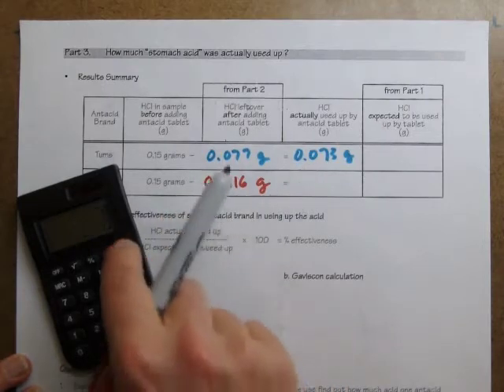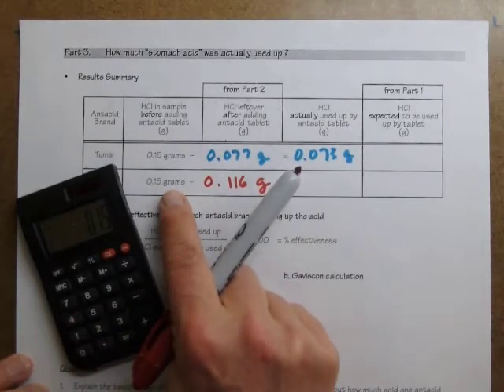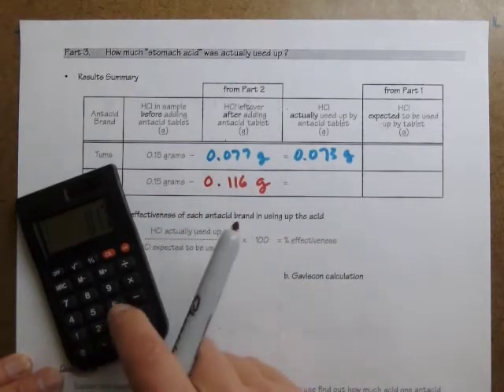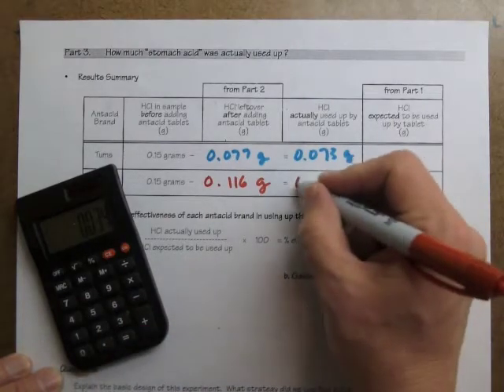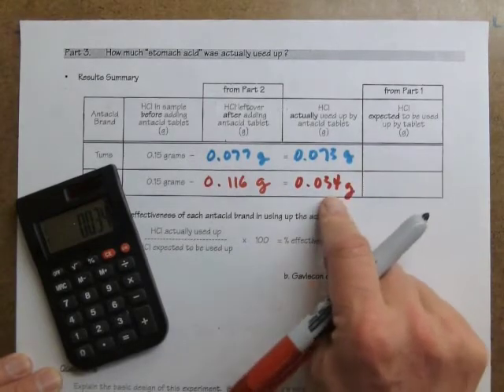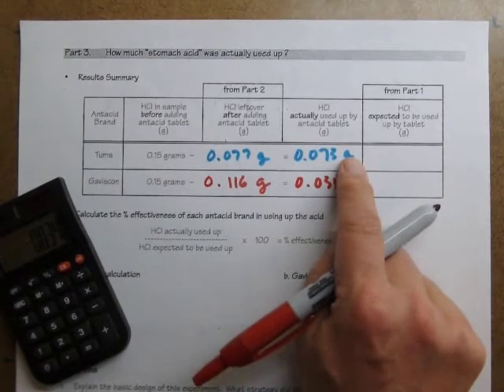We'll do the same calculation here. 0.15 grams of acid were in the sample to start. This is how much was left, 0.116. So it used up 0.034 grams. A lot less acid was used up by the Gaviscon compared to the Tums.